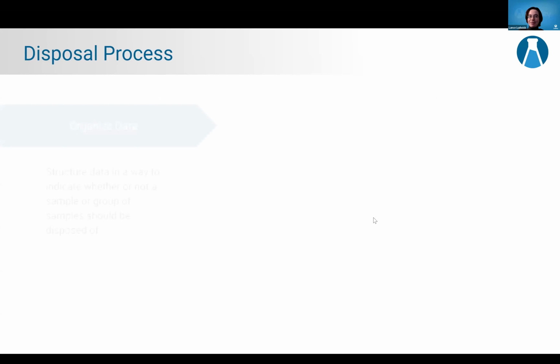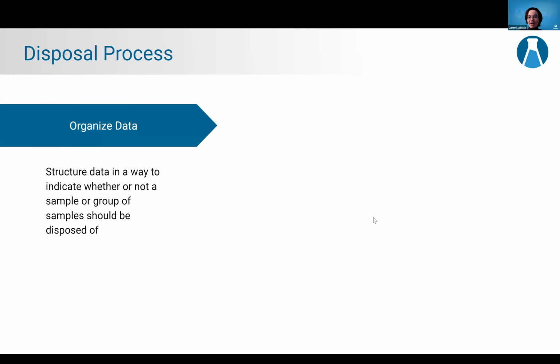So to summarize, Sample Manager would have saved me so much time on my archive project, and hopefully it's going to be helping you all save time on your different projects. And of course, this project that I worked on went from years to a couple of months with Sample Manager. So Sample Manager can help you too.